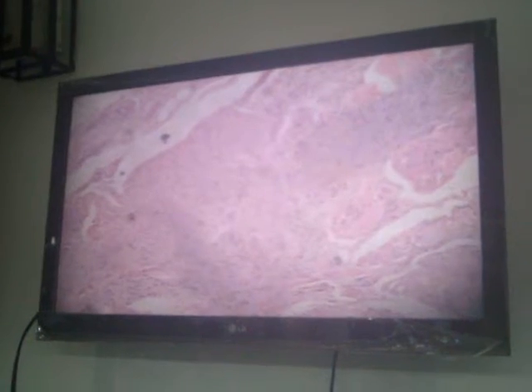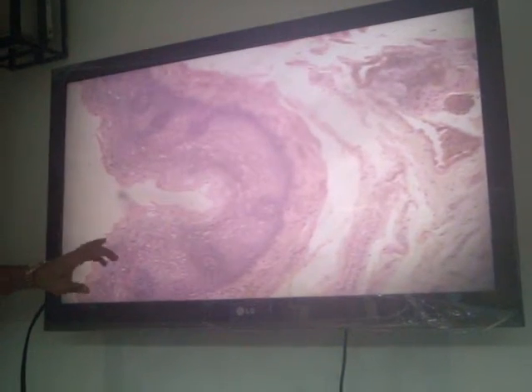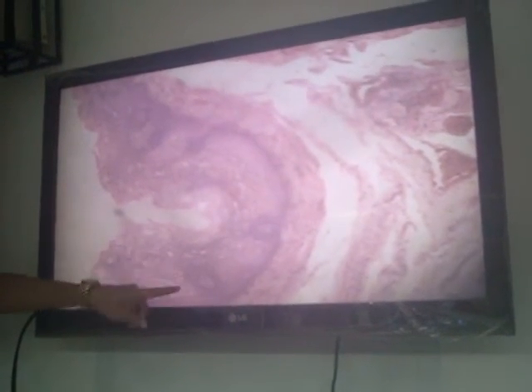Now, for our pseudostratified ciliated, yung trachea, class, ang organ natin sa pseudostratified ciliated. Tapos, stratified squamous non-cornified. This is your esophagus. Yung focus, class, dito sa lining epithelium. Dito lang, ha?